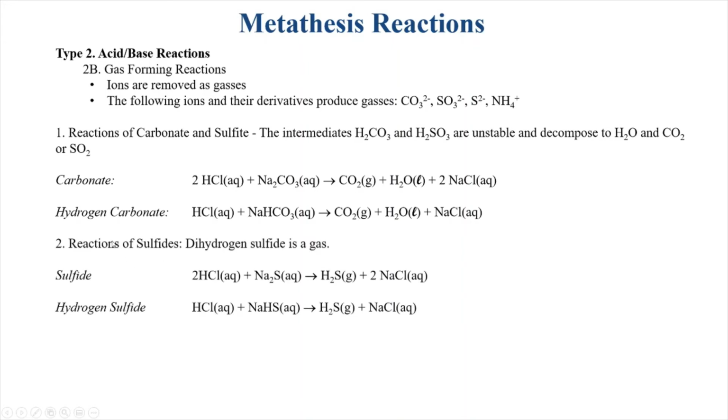So the reactions of sulfide. Sulfide, S2-, when you react this with acid, you make H2S, and H2S forms a gas, and it has a rotten egg odor. So again, when you mix HCl with sodium sulfide or hydrochloric acid with sodium hydrogen sulfide, both of these reactions will lead to dihydrogen sulfide gas.